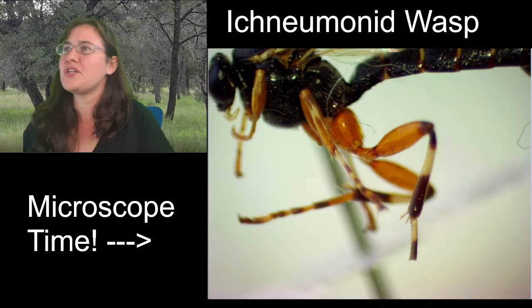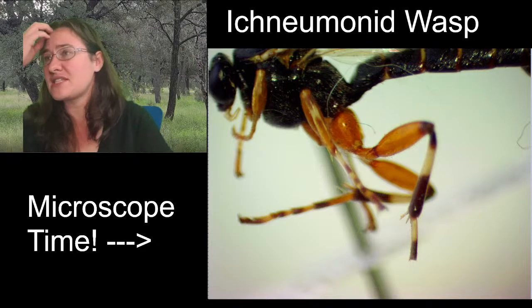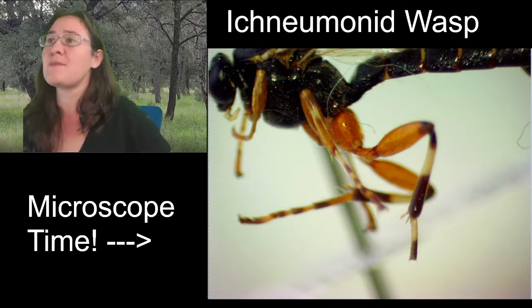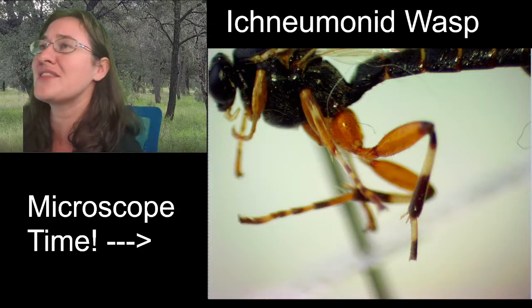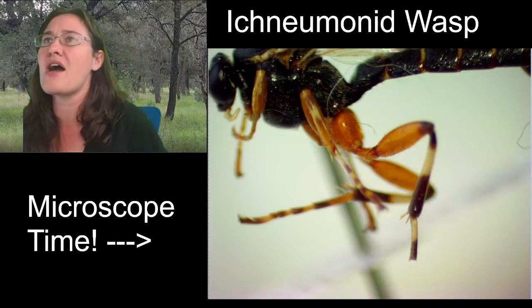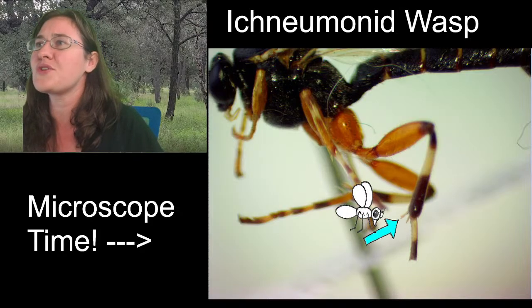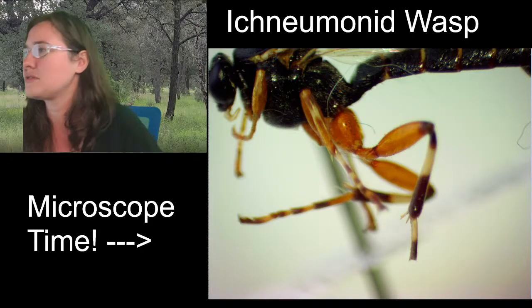All right, so we're going to leave the focus here so that we can see the tibia and the stripe on the tibia. You can also see both of the tibial spurs. If you look at the end of the tibia of our hind leg right about here, you see 1, 2. Those are our two tibial spurs.